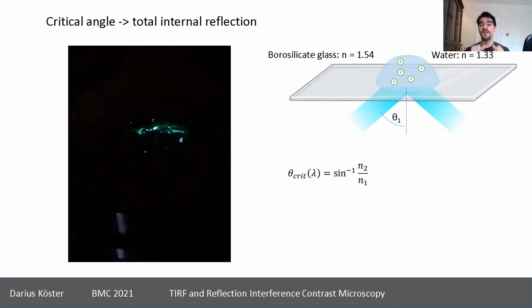So use either a slide where you just drop some fluorophore on it to absorb, and then you get a surface that is supposedly homogeneously labeled, or a supported lipid bilayer that has some fluorophores in there or something like that. But you have to check, and it's always worth playing around with the laser angle every time to see whether you can get a nicer field.